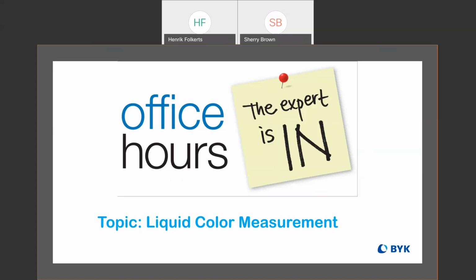Another question from Dustin. Are the APHA range scales matched up for specific frequencies that match up with the archaic methods? Or what are the APHA range integrations considered? Or does it integrate with the whole spectral range?